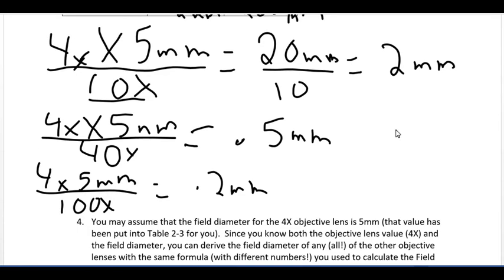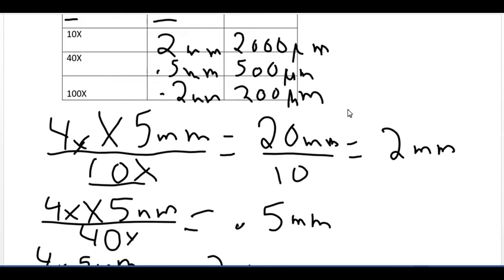The connection between these two is, in order to know how big a particular cell is, I need to know what that whole space is that I'm looking at. Sometimes I use the analogy of going to buy some furniture for a particular room. You go into the furniture store, eyeballing sizes. What you really need to know is how big that room is, is it a 10 by 10 or 10 by 12? Then you can entertain the thought, will this item fit? Can I fit 4 chairs? Can I fit these things across the room? Maybe you're looking at a set of beds and will they both fit in the room? So you need that space.